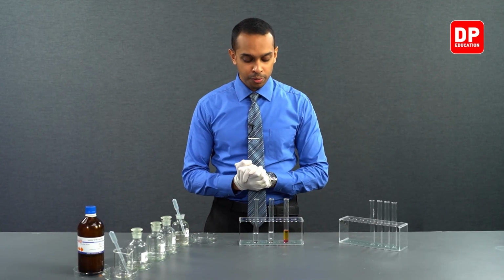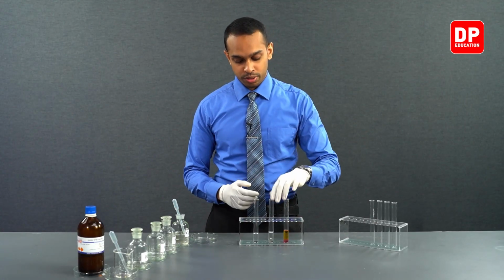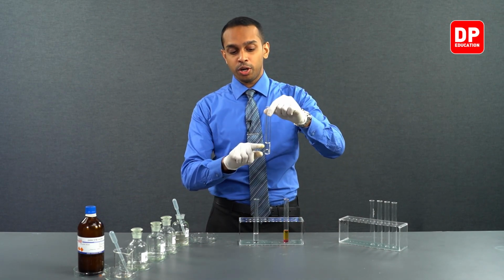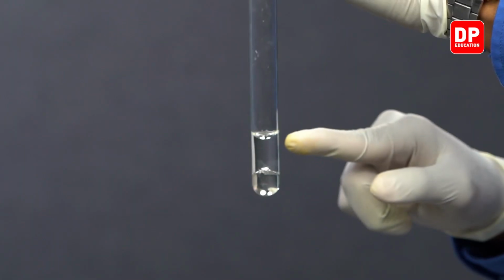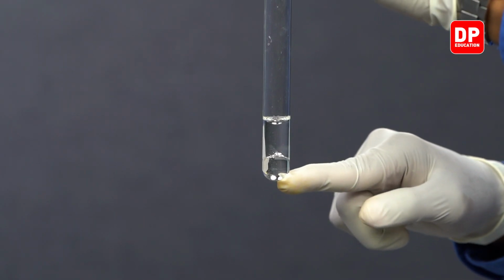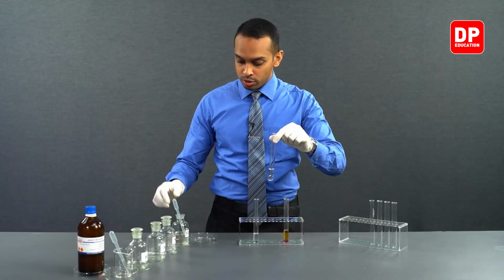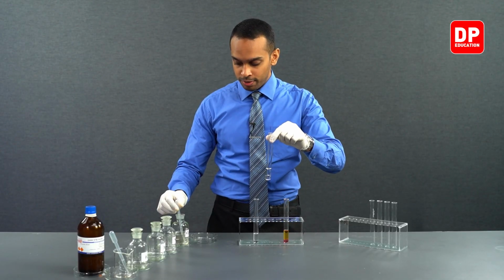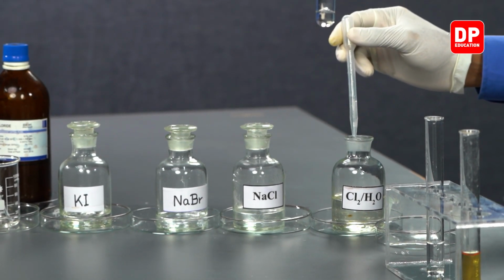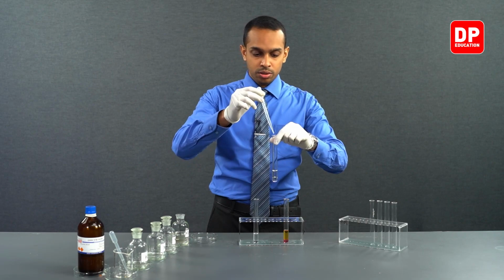Now let's move on to sodium bromide solution. So we have sodium bromide solution. The top layer over here is our aqueous sodium bromide layer, and at the bottom is our carbon tetrachloride layer. To this, we are going to be adding a little bit of a chlorine water solution. So let's add a little bit of chlorine water.